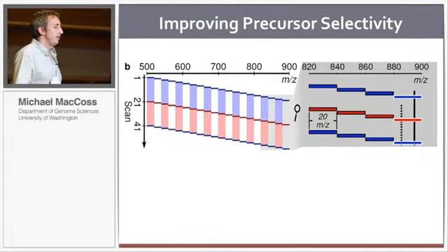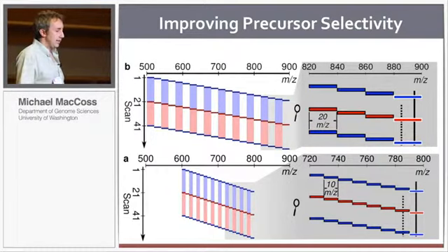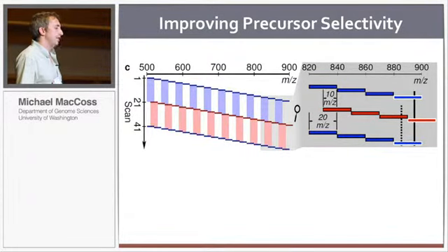So here's how we're proposing to solve this. Basically, we have the normal idea of a 20 mass-to-charge wide window, and you can improve the specificity by going down to a 10 mass-to-charge wide window. What we'd actually like to do instead is shift the windows by 10 mass-to-charge. So you measure with 20 mass-to-charge wide windows, but in alternating sets of cycles, you shift them by 10 mass-to-charge.